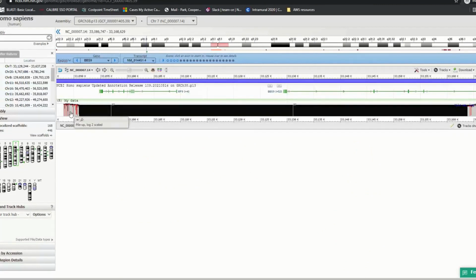Well, this Pileup view basically looks like it has three colors. And from the legend, I can tell you that the gray section of the view represents a solid alignment between my data and the reference sequence. The little spots of red in that gray represent mismatches in that alignment. And then this big block of black that runs across most of the sequence alignment is actually a gap between my data and the alignment.